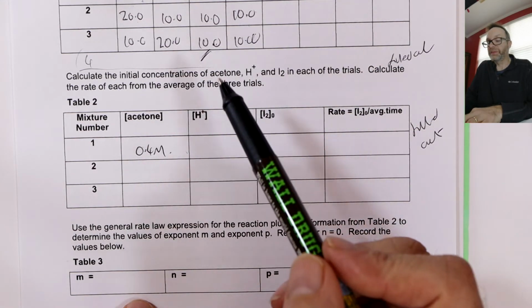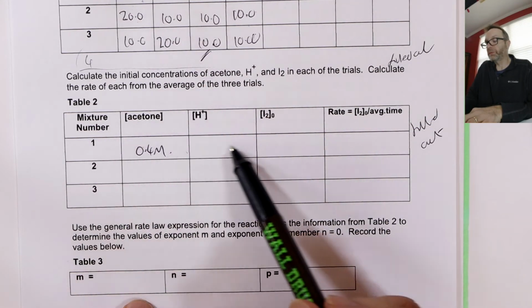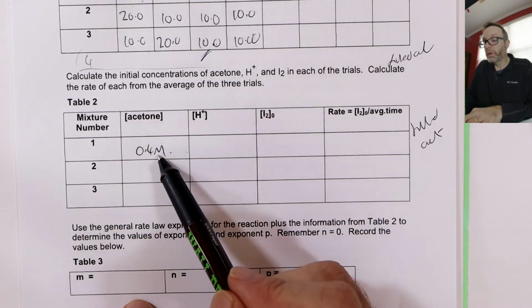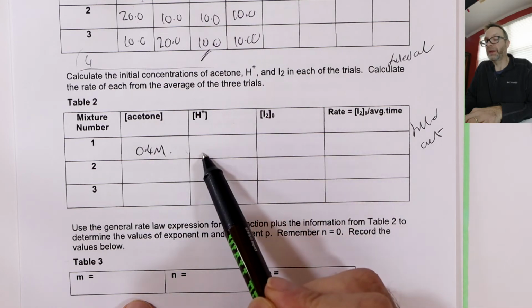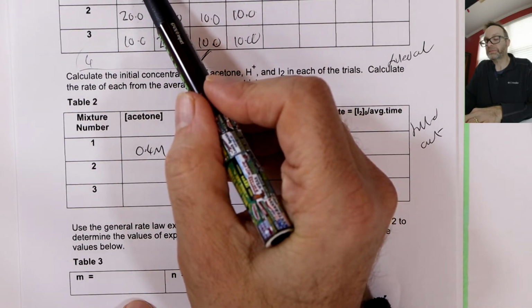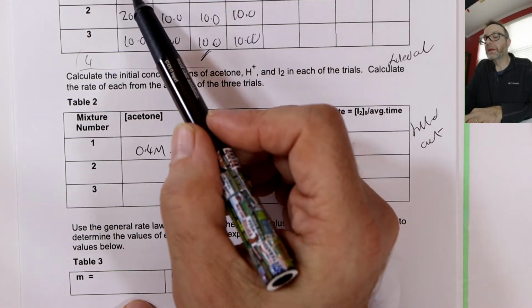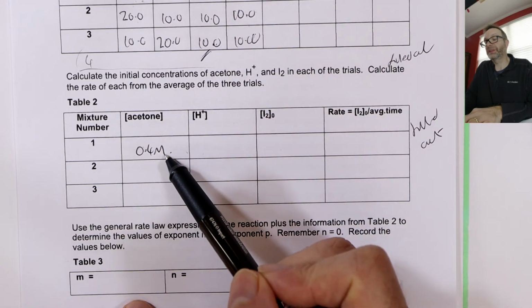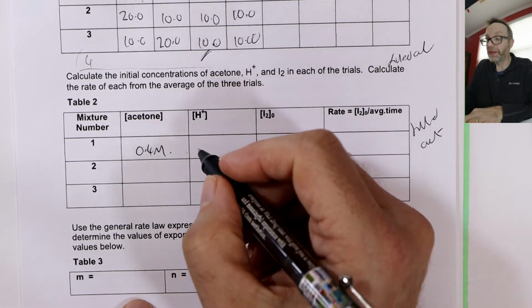when you actually figure out in experiment 1, experiment 2, and experiment 3, what the actual concentrations were, you just take the concentration and it's 1 part in 5 essentially, so it's divided by 5, right?